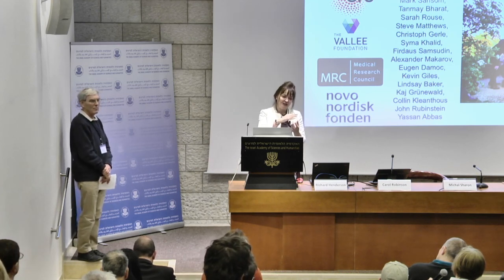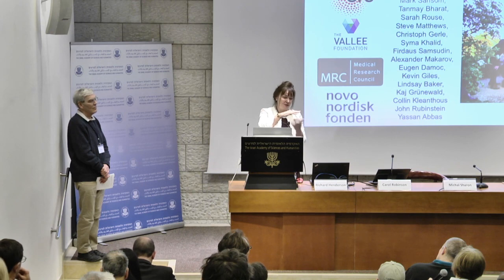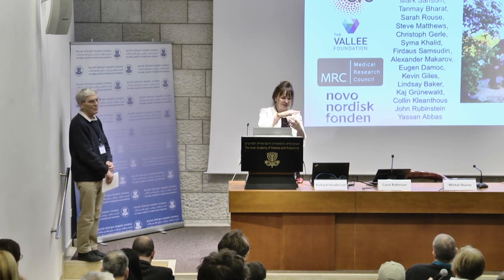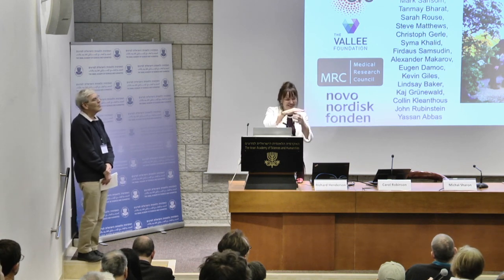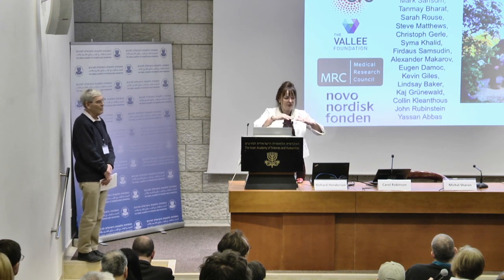But I think the mechanism is you have it in the membrane, you need something to pull it. So you have to charge it up either with a chaperone or with ATPase. Of course, it's got a big head, so that charges and pulls it out of the membrane. So I'm quite happy that we're not keeping them as we think they are.